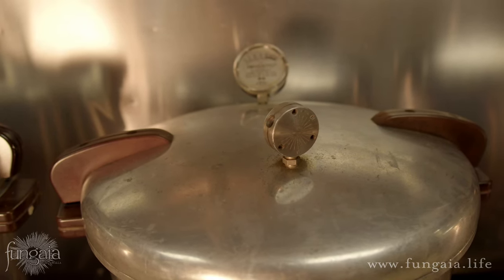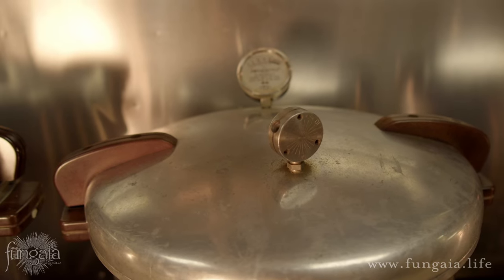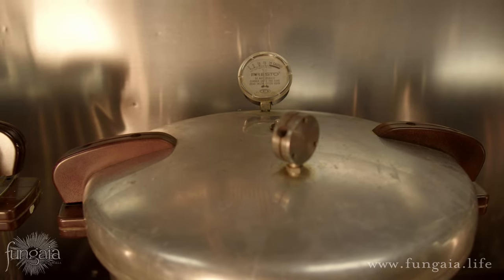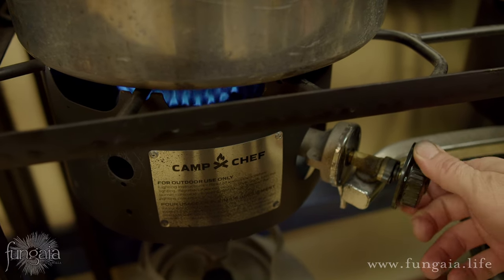Set your timer for 90 minutes and keep an eye on it as the grain sterilizes. If this is new to you, make sure to take a little extra time to learn how to use a pressure cooker properly — read the instructions and check out my video on the subject.